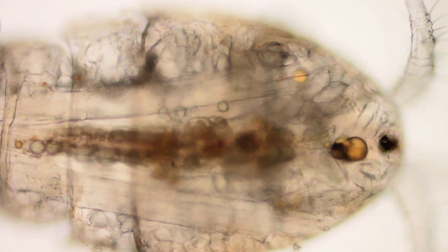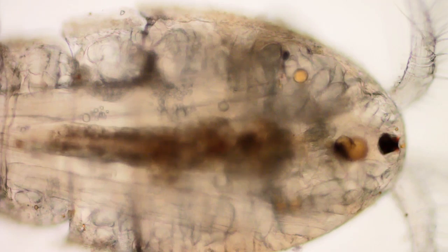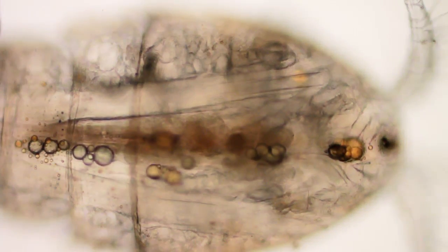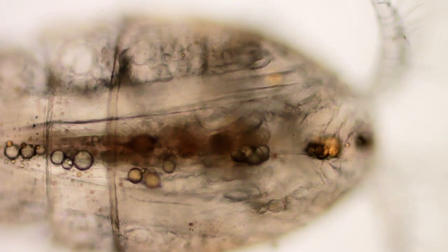I think we're looking through from the back, down through — there's her gut, her food. Down through, there's the muscles — lateral muscles on both sides of that brown streak in the middle. Those are what wag the tail.